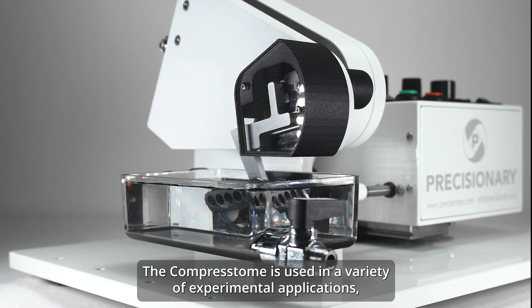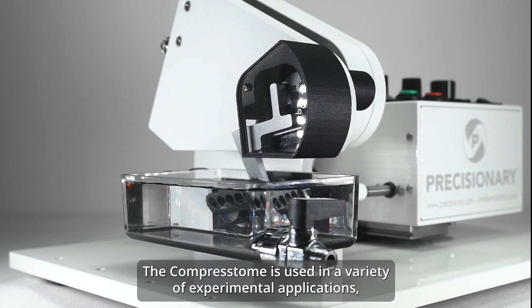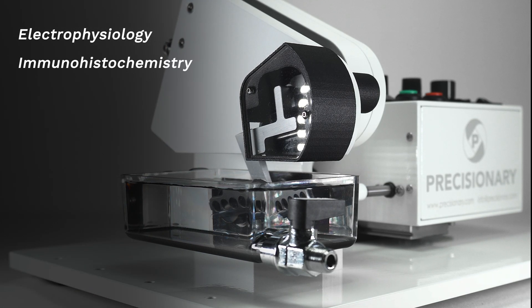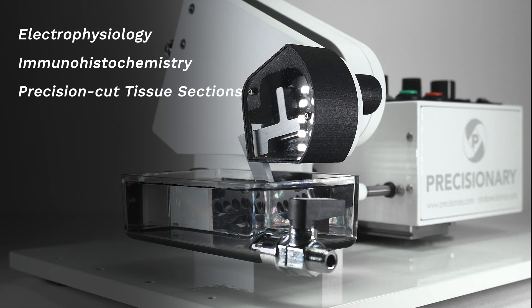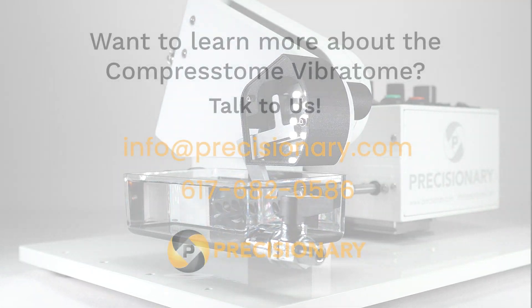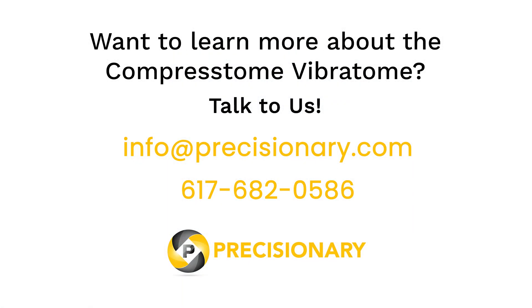The Compresstome is used in a variety of experimental applications including electrophysiology, immunohistochemistry, precision cut tissue sections, organotypic slice culture, and more. Call us to learn more about the Compresstome and how it can help with your research.